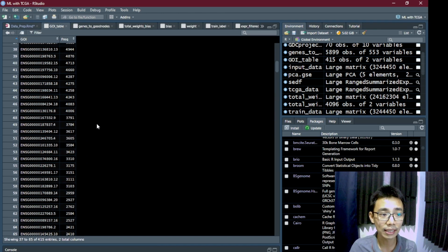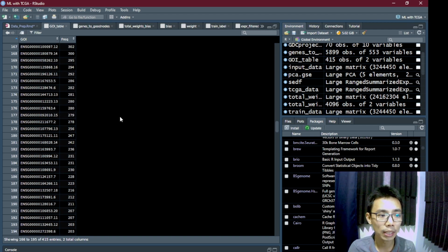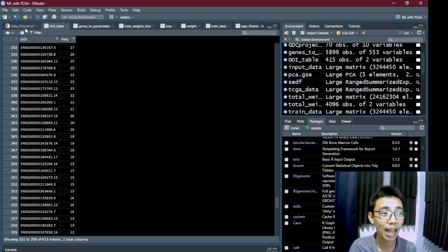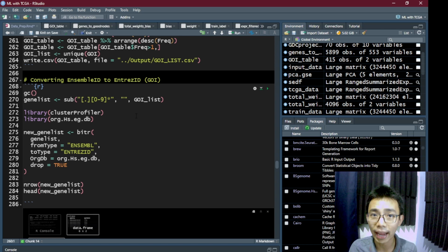So now we have this table, and these are our potential biomarkers. But running gene by gene is kind of silly and kind of bad, and I'm using a cutoff, so I don't want to say absolutely these are correct. So what I'm going to do is something called gene set enrichment analysis, which moves us towards section 3 of this workshop.